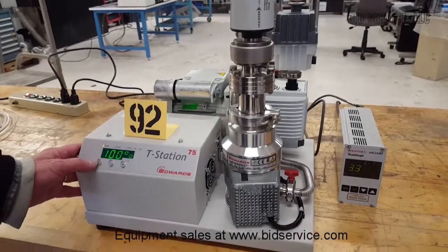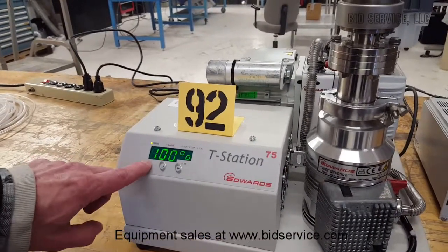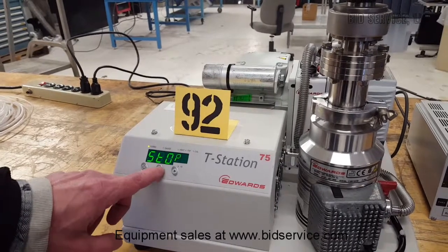In order to stop this, what you need to do is hit the button on the left here. You'll get a stop prompt, then hit enter.